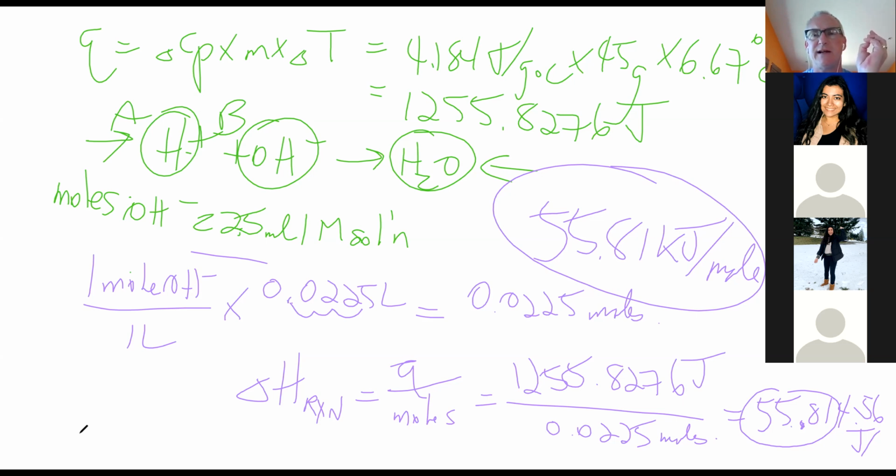Does anybody else need any help on how to actually do the experiment? I just have one question. How do you measure the weight in the first reaction of the solid sodium hydroxide? Can you show me again? Sure.